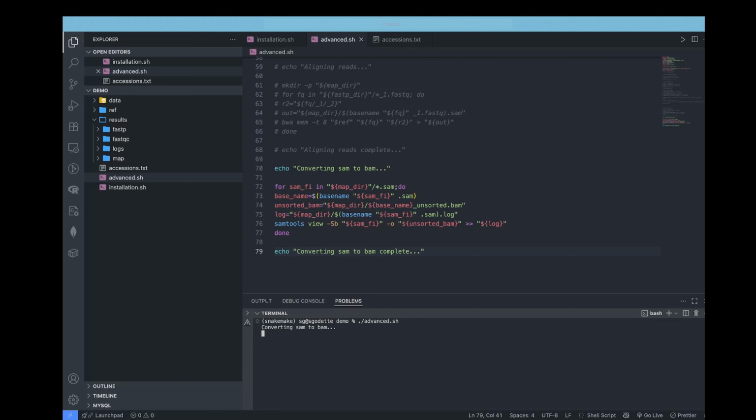And the reason as to why we need the pipeline and the workflow in general is to ensure that we can dynamically handle as many files as possible without making mistakes and without wasting time. So at this point, the conversion from the SAM to BAM is complete, and we can now work with the BAM file in our downstream analysis. Now, the next step is to make sure that we sort the BAM files and to index them.